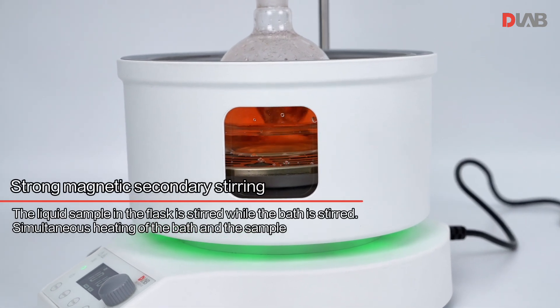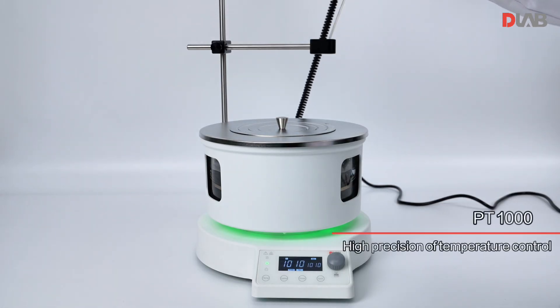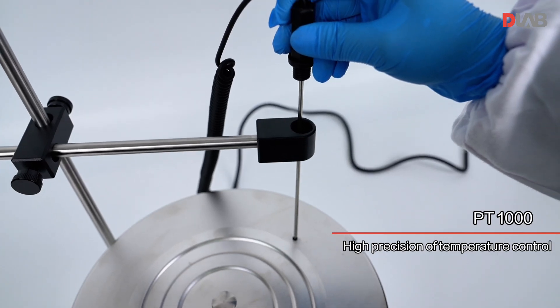Strong magnetic secondary stirring: the liquid sample in the flask is stirred while the bath is stirred, enabling simultaneous heating of both the bath and the sample. PT1000 sensor provides high precision temperature control.